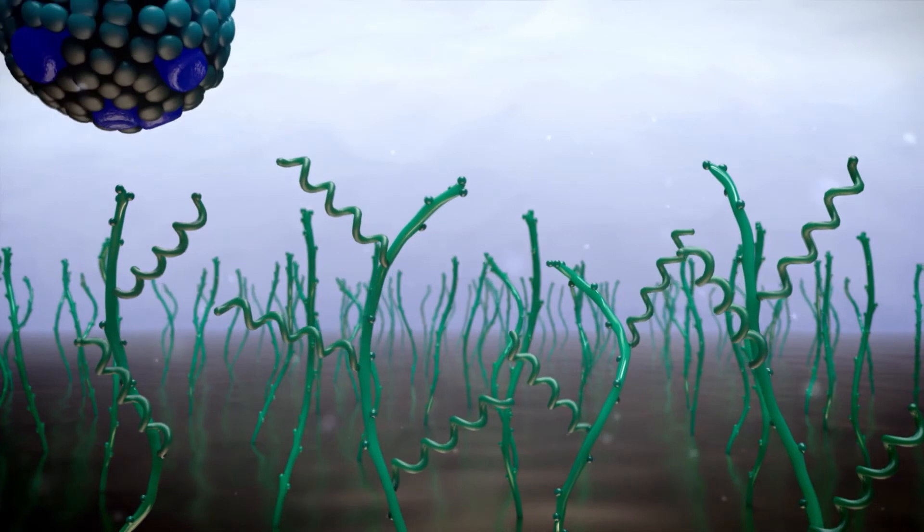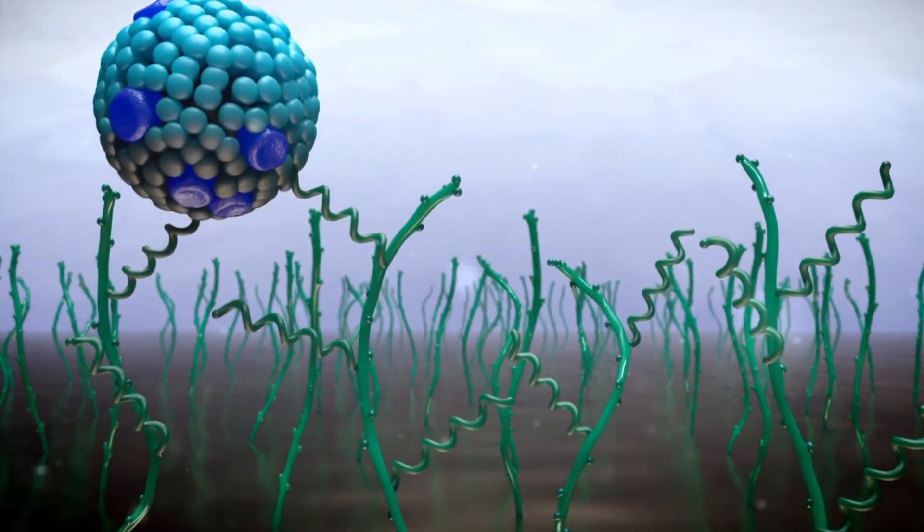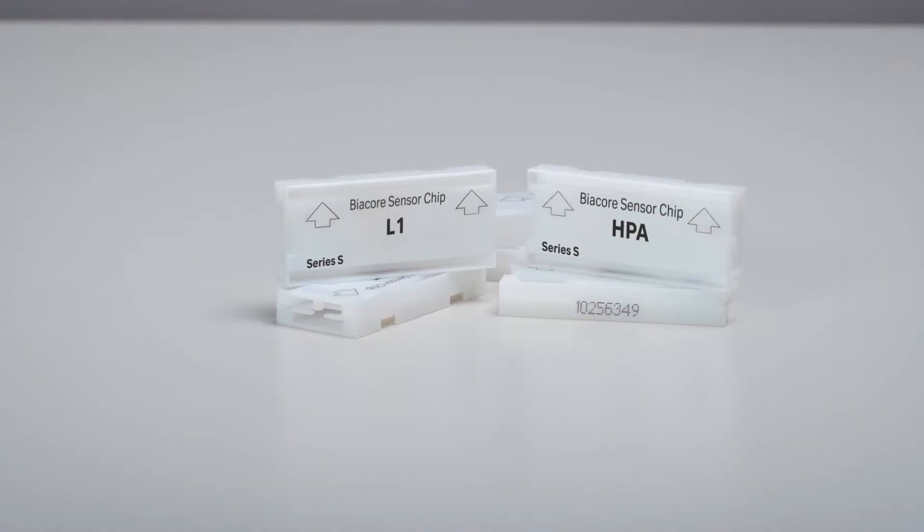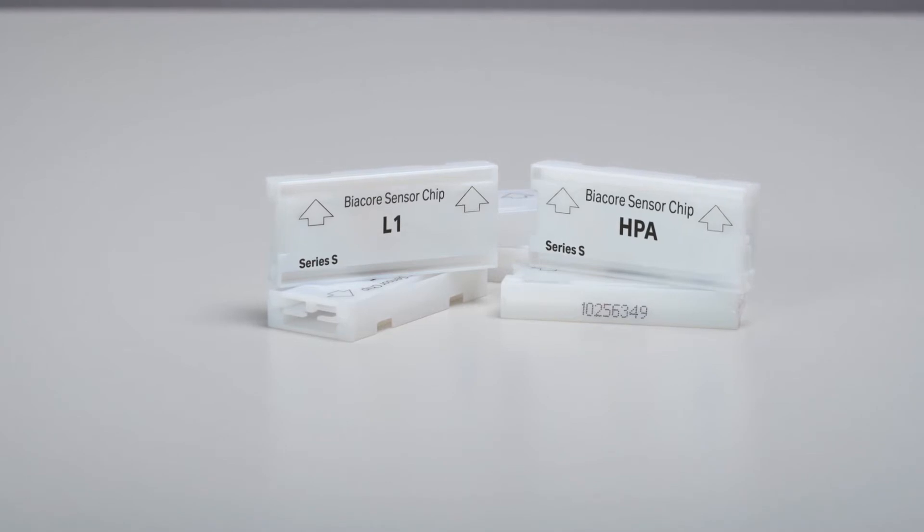Hydrophobic molecules like lipids can bind to the hydrophobic groups introduced on the surface. Alternatively, the surface of sensor chip HPA is already hydrophobic and can be used directly.